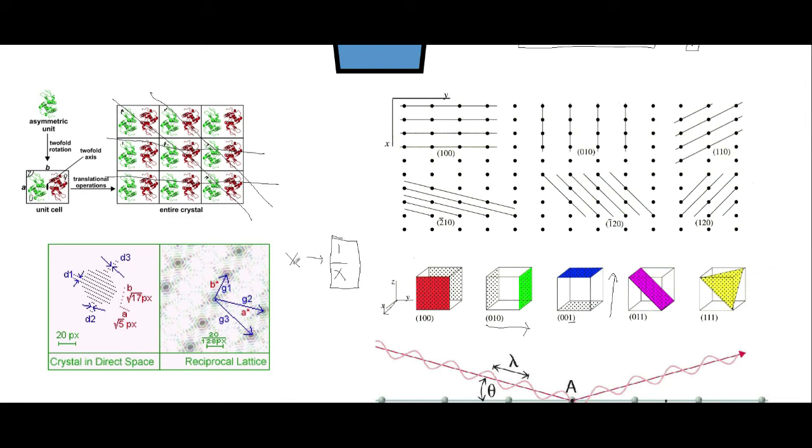And so as things get further apart in real space, they get closer together in reciprocal space.